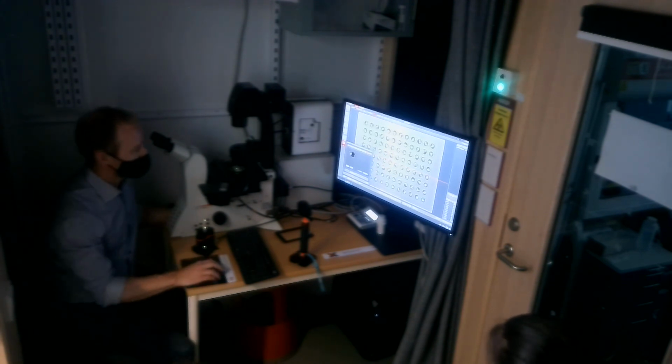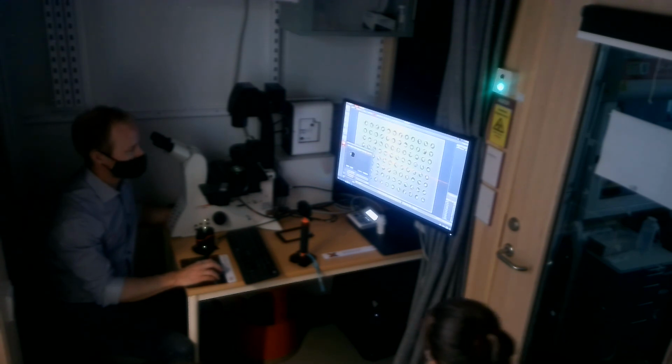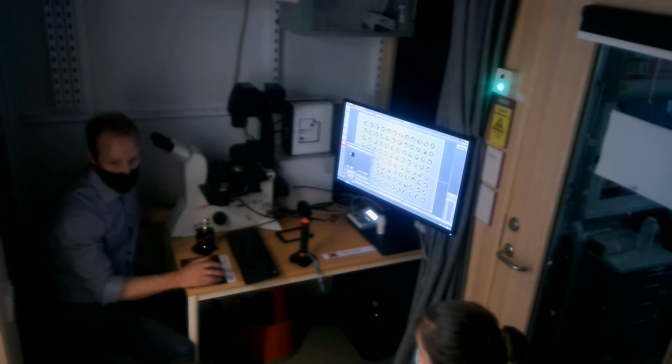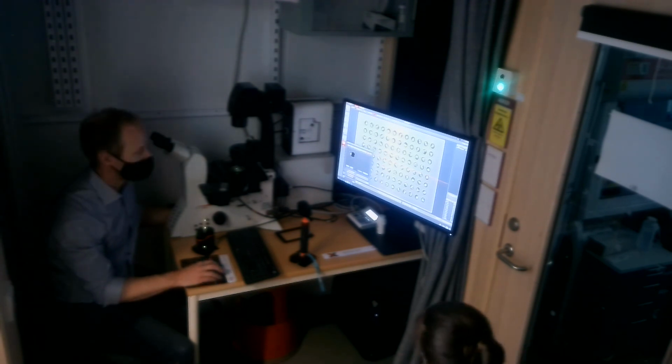Okay. So the rest works. You have some options here. You can align for chamber edges or chamber center. So sometimes, depending on the field of view and the size of the chamber, the center might make more sense also. So you have those options here.